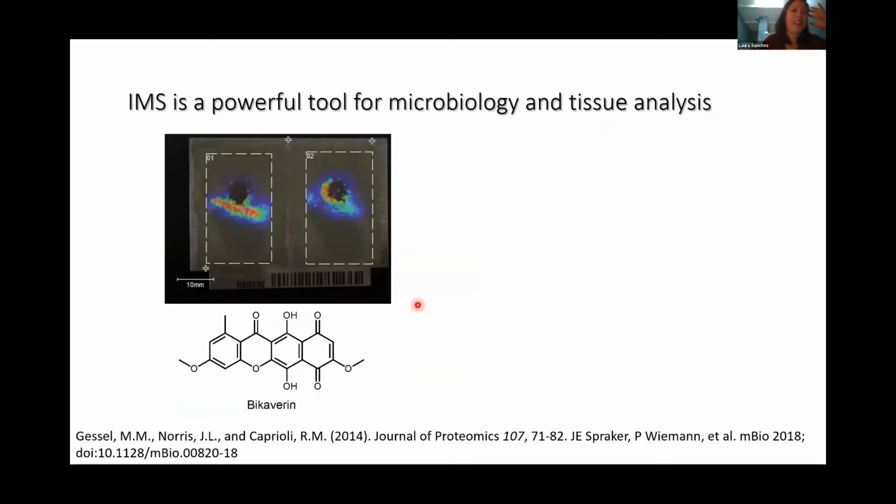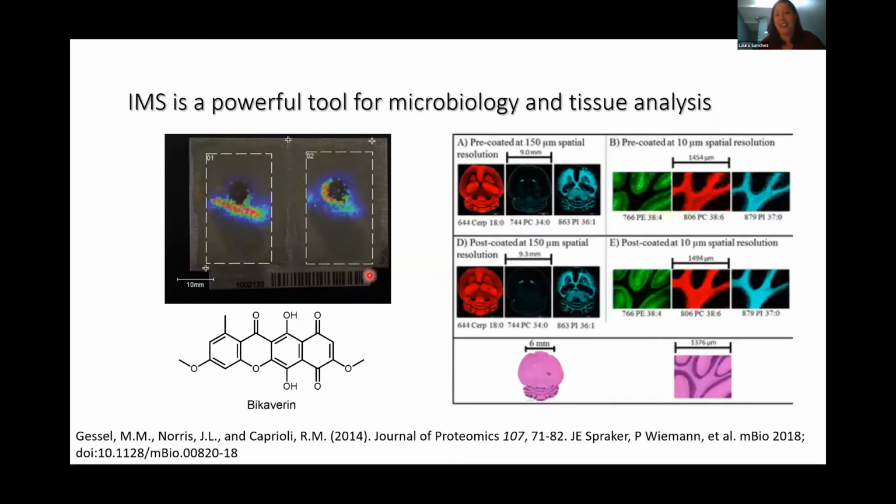And so I hope that everyone in this audience, mainly because Shannon already said his piece right before I started, sees that imaging is a powerful tool in microbiology. But that was not the first use. I would say tissue imaging is far more popular. I'd like to point out this review, which is a nice subset of what people have been able to do with lipids. But most of the time this is done on tissues or tumors that are already there, versus microbiology, where we can grow these things and essentially run pseudo time courses. This allows us to see what happens before a final endpoint like a tumor.